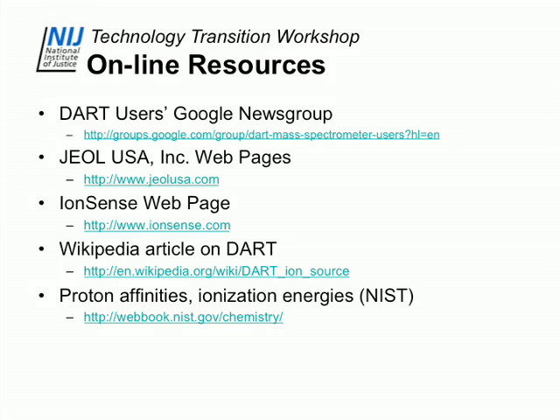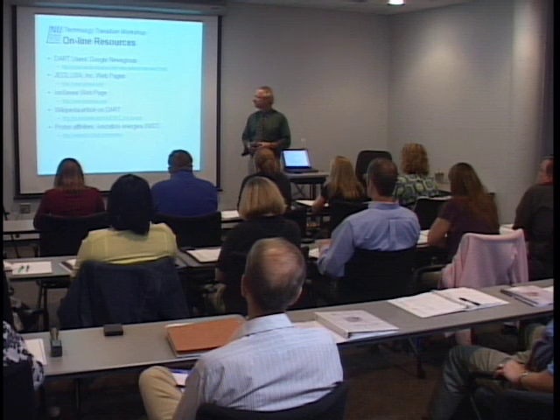If you want to get down to the nitty-gritty, the NIST website has a really good resource for ion information, ion thermochemistry and gas phase ion energetics and things like that. So if you want to look up proton affinities or ionization energies or anything like that, you can go to the NIST web book and you can type in compounds. They can show you mass spectra. They've got IR spectra. It's a very nice public resource. Obviously, not everything is in there, but often if you can't find a compound you're looking for, you can find something similar to it and take a look.